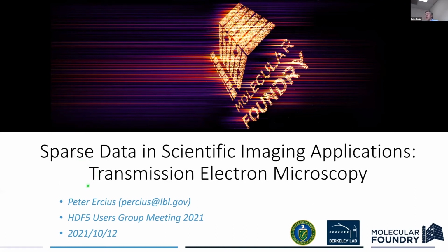Okay, so I work at a place called the Molecular Foundry, which is a knowledge-based user center in Berkeley, California, where we do a lot of nanoscale research science. Basically, the facility has almost anything you want in order to do nanoscale research. And I specifically work on something called transmission electron microscopy.